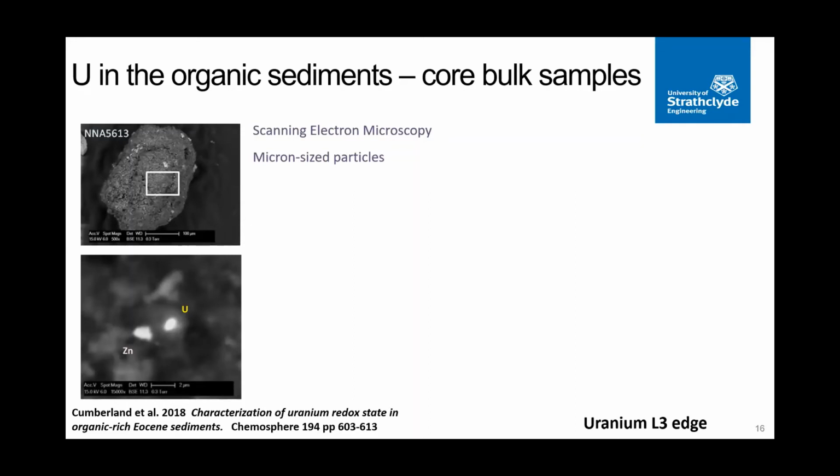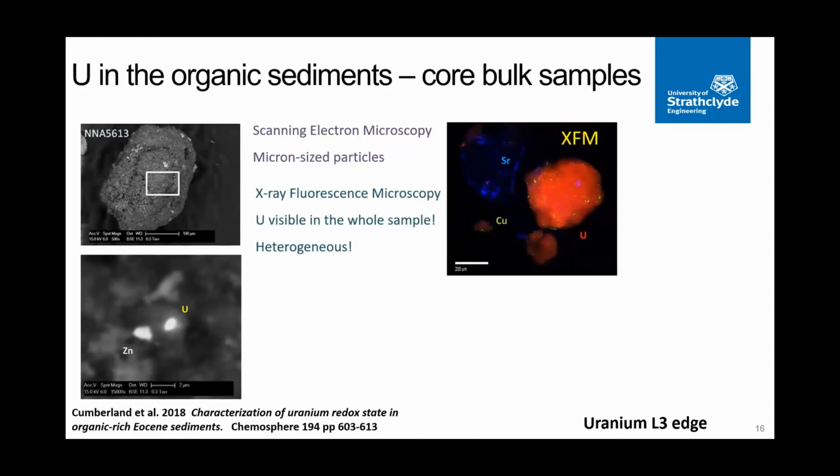But I managed to pull out some of these smaller grains and take them to SEM. After a lot of searching, I found two bright phase particles, and of course only one of them is uranium. So really the question was, where is the uranium? That's just where the XFM really came in. So we took particles from the same pond and took them to XFM and scanned them.